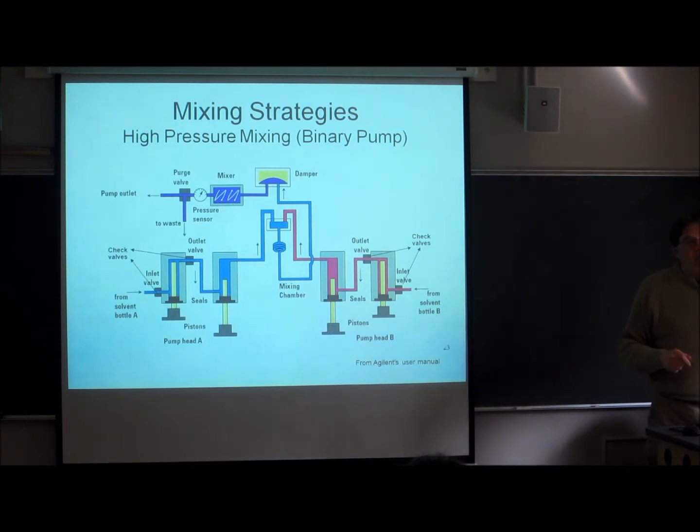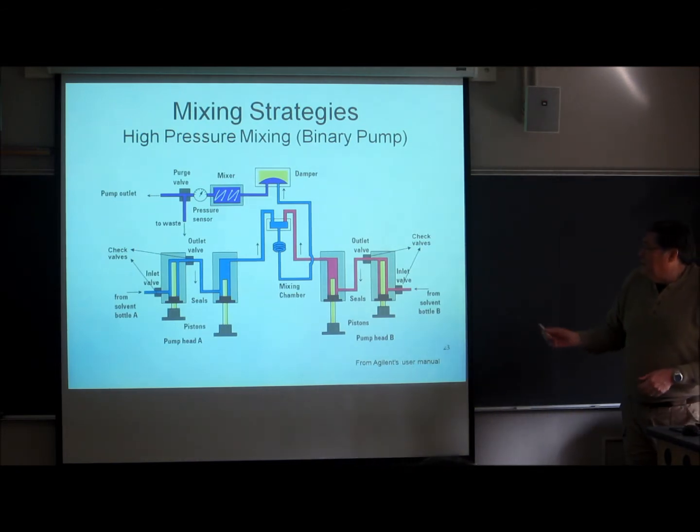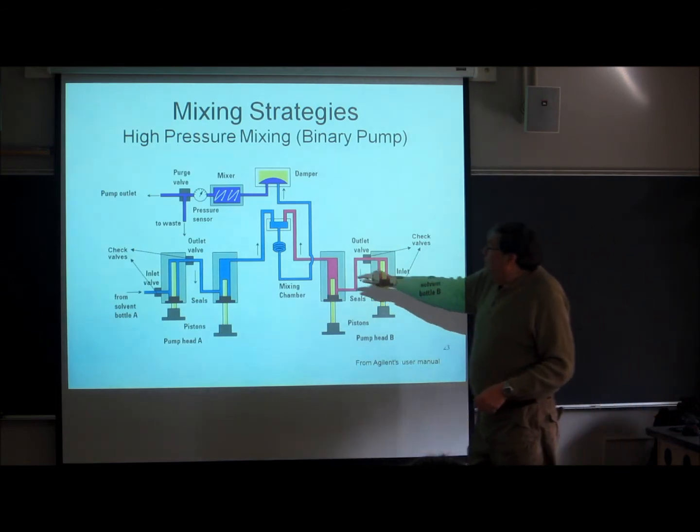There's an alternative. You can sparge, it's called, the solvents with helium. Okay? And helium is not very soluble in solvents of any kind. And since it's not, when you have a lot of it in the solvent, it'll drive out the other gases, and you'll be left with just a small amount of helium, and you won't have the trouble with the bends. Okay? So this shows about everything except this shows mixing.